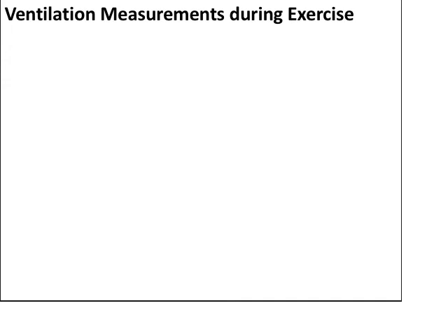Then measure and record the circumference of the balloon using the measuring tape, wrapping the tape around the widest portion of the balloon as you did previously when you did your tidal volume and your forced vital capacity. Record the circumference under Trial 1 next to circumference of the balloon at the end of exercise in Data Table 5. Repeat steps 30 through 36 in your protocol 2 more times and record these values in Data Table 5. These will be Trials 2 and 3. Rest as long as you need between trials.